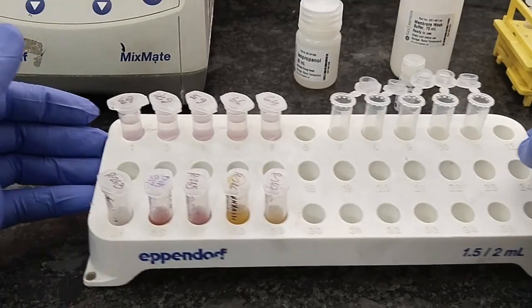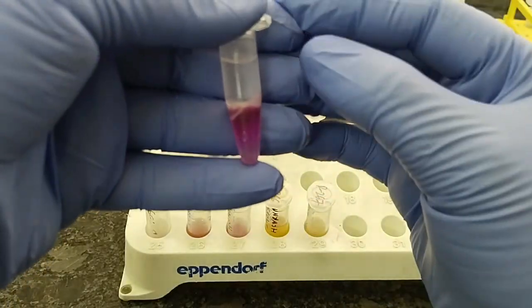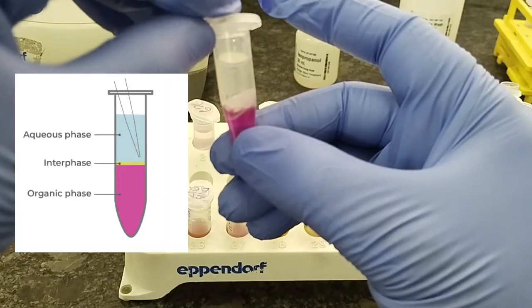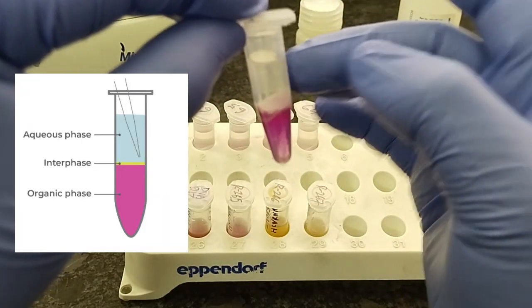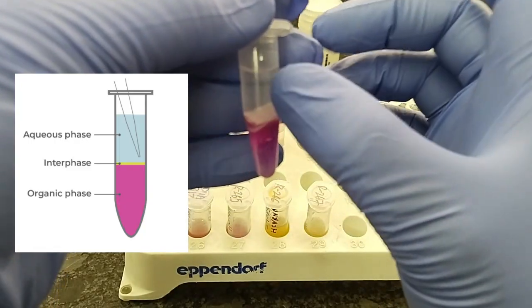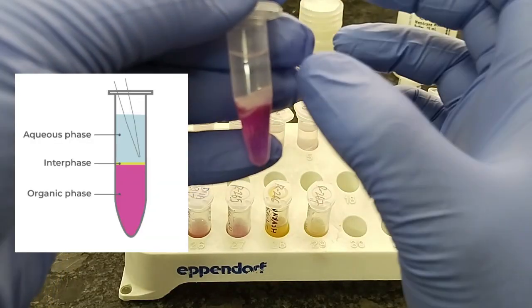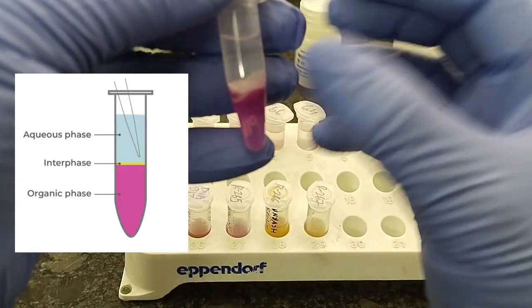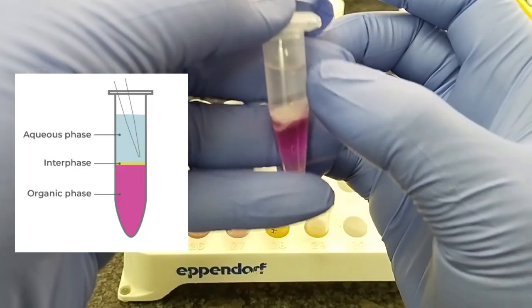Centrifugation is over. After centrifugation, the tube looks like this. Here we can see three phases are separated. The first one is called the aqueous phase. Here all the RNA is collected. If there is a virus in the sample, then the virus gets lysed. After the lysis, all the RNA is collected in this aqueous phase.